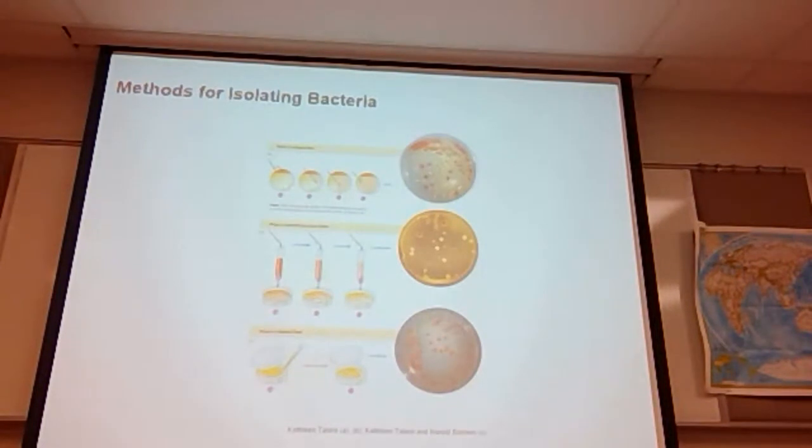If you look very closely at this, what this person has done with the inoculating loop is they've gone back and forth over the top portion of this plate. Then they've stopped. They've sterilized that loop again with fire. Then they've come through it going this direction here. And then they will again sterilize by fire and go back this way. Therefore, they've gone several different directions.